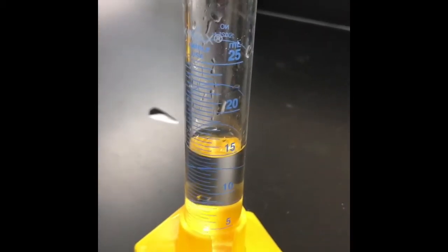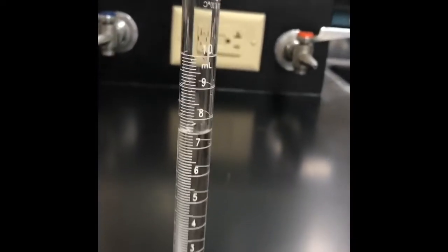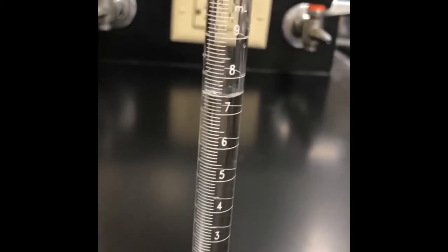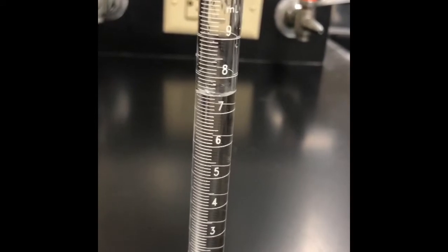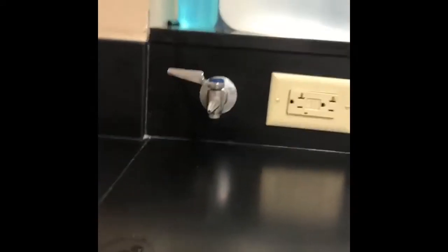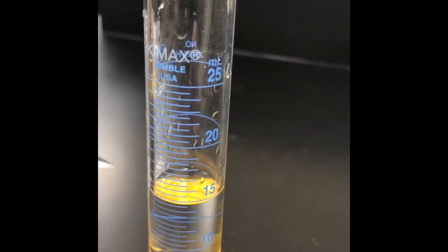The 25 mL graduated cylinder goes by fives. The 10 mL graduated cylinder goes by ones, so each tick is going to represent a tenth of a milliliter, and each tick on the 25 mL represents half a milliliter.